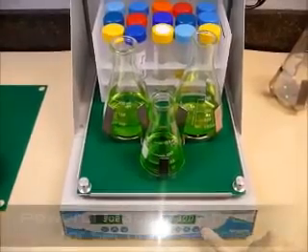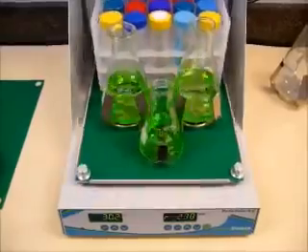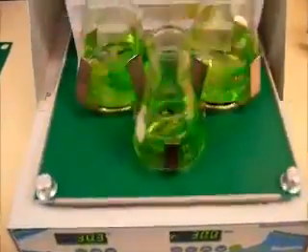Regardless of sample size, there is never a concern of disconnect or breakage. Even at the maximum shaking speed of 300 RPM, vessels remain securely attached to the platform.